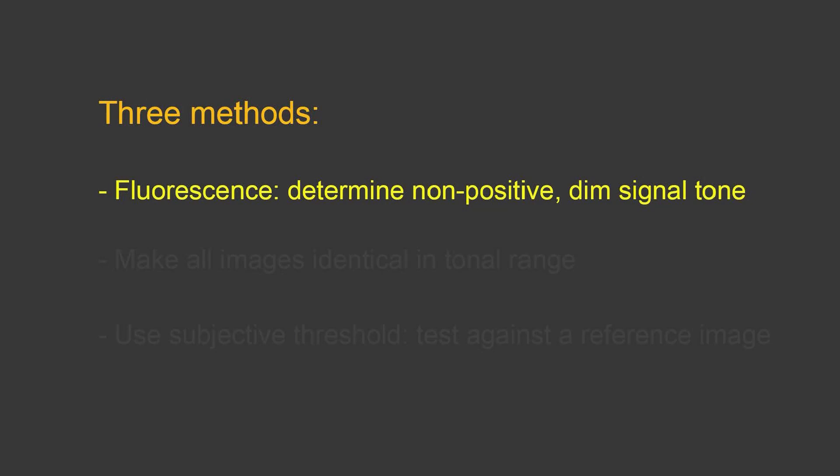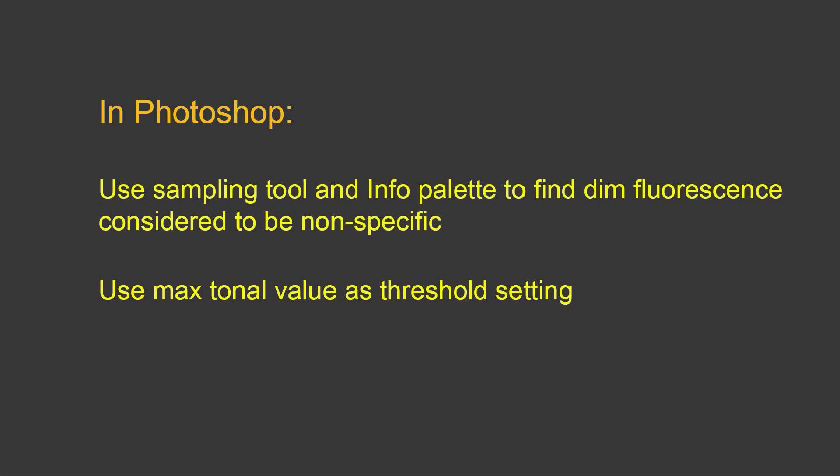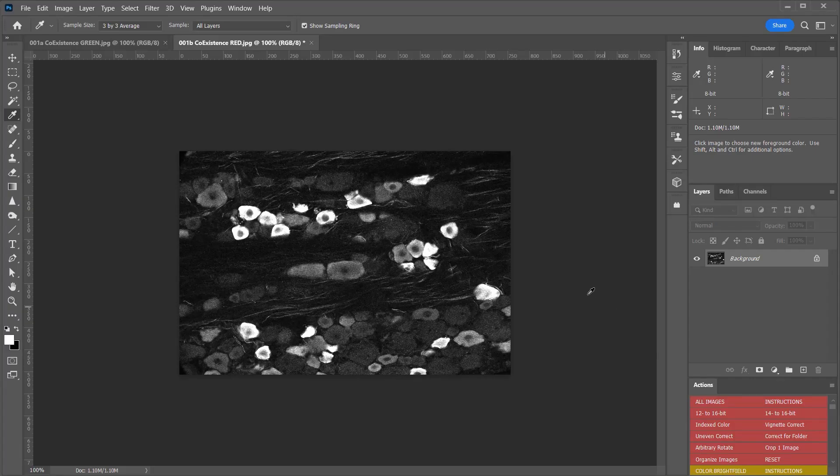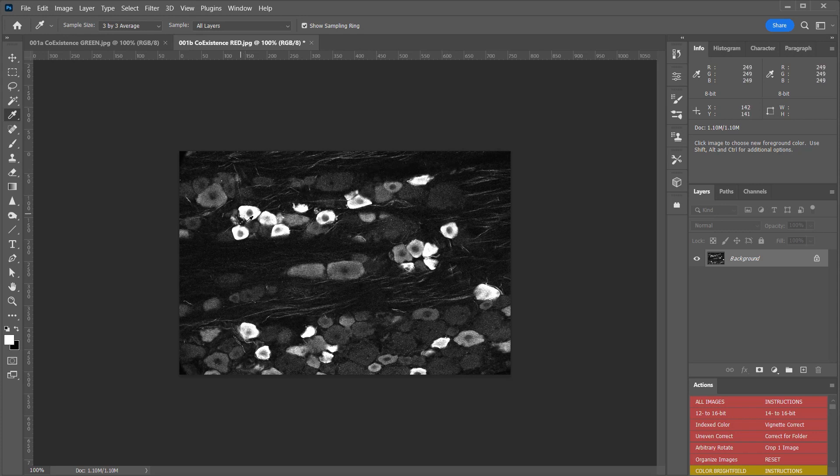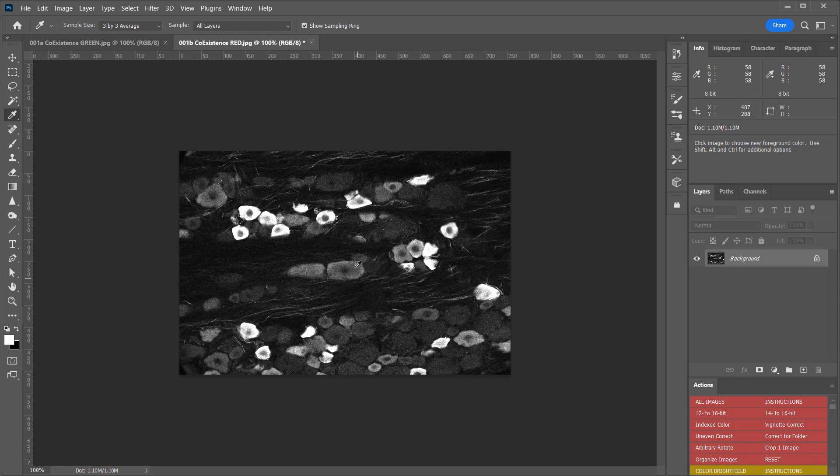Let's talk about fluorescence first. Talk about determining a non-positive dim signal tone to then determine the threshold value. In Photoshop, you'd want to use the sampling tool and the info palette to find dim fluorescence considered to be nonspecific, and then you use the max tonal value as the threshold setting. Here in Photoshop, we have a fluorescence image, and you can see that there are brighter parts of this image that you would want to measure, and dimmer parts where there's some fluorescence or some value that's above background where you wouldn't want to measure. And so what you need to do then is determine what the brightest signal is here in the nonspecific areas so that you can then set a threshold that's above that.